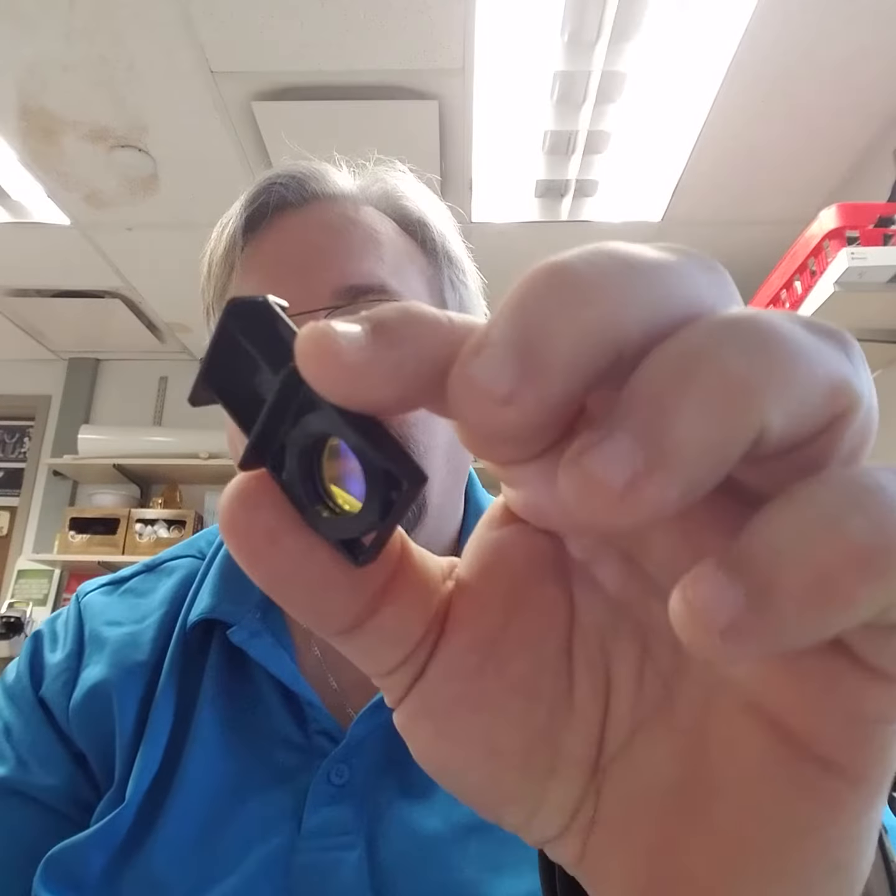Now on top of that, on a lot of instruments now, we have a mirror that's directing the light around a octagon, a trigon, things of that nature, and that's what this is here. And this is a long pass filter, 525 nanometers. Light above 525 nanometers will pass through this. Light below that gets reflected away.